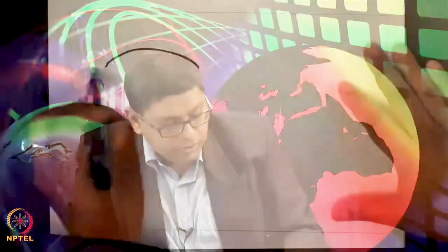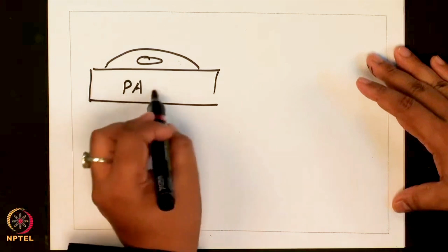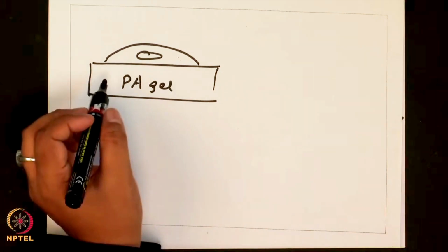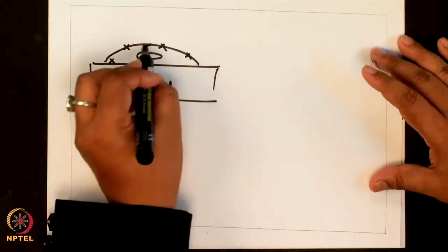Okay. So, with these models, okay, if I were to draw a picture of a cell like this, it has a finite spread, okay, sitting on a gel, let us assume. Okay. So, you use this formula and let us say you try to go out and find out the stiffness at 4 different points.